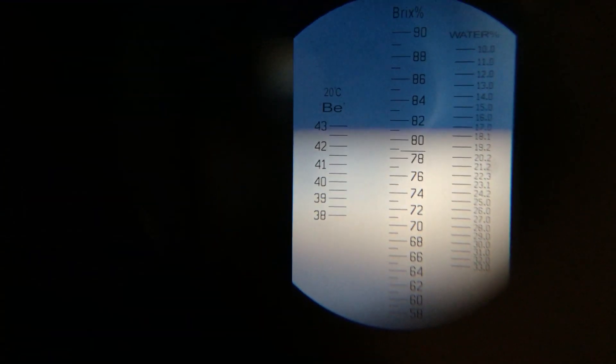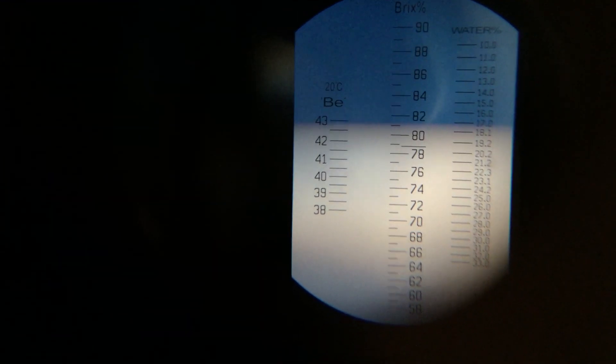There you go — right at about 17%-ish, so we're good. Anything under about 19%-ish is ideal, so that's it.